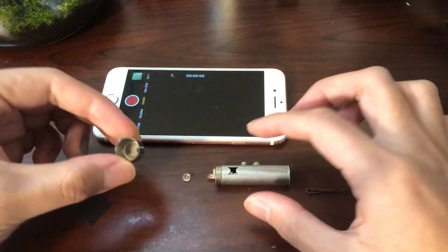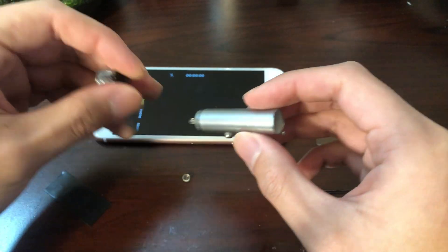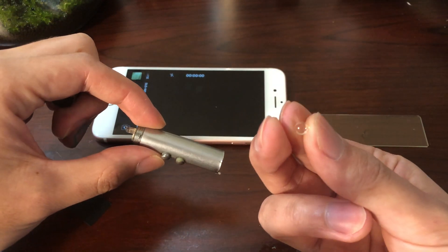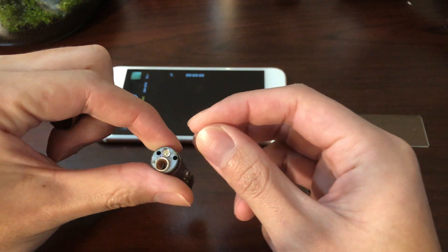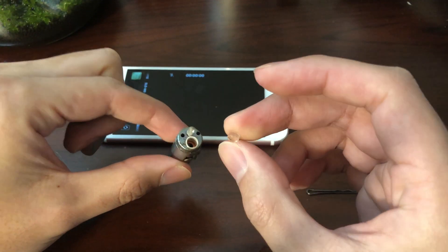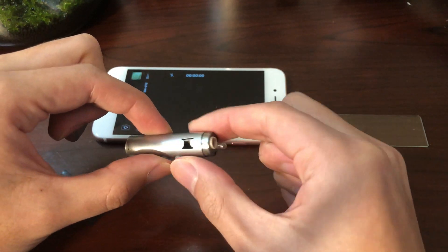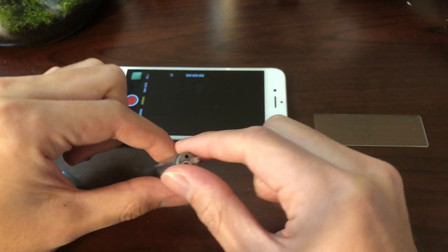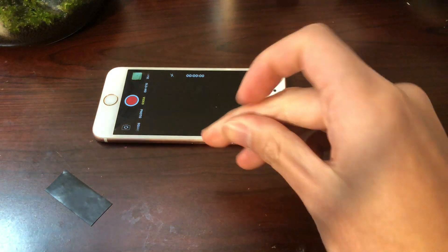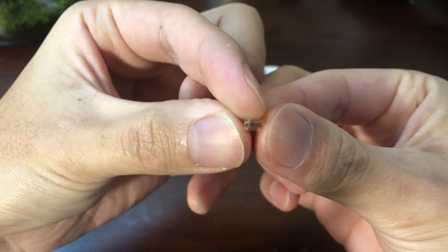The second thing is a laser pen. I've already taken this laser pen apart and as you can see I kind of broke it in the process. Don't expect to keep your laser pointer, but what we're looking for is this lens in the head of the laser. Usually it was in here but I had to use a little finessing to get it out. You might need pliers and it can get really hard, but as long as you can get it out that's fine. What we're really looking for is this laser lens in the head.